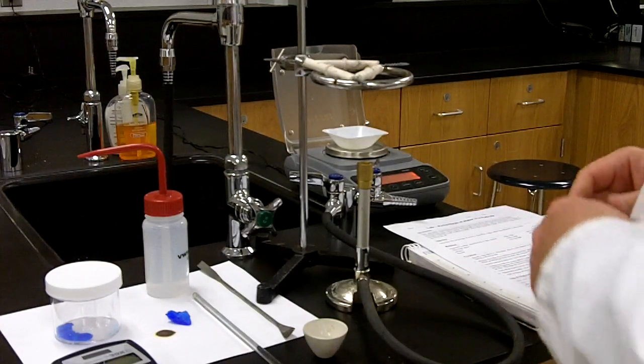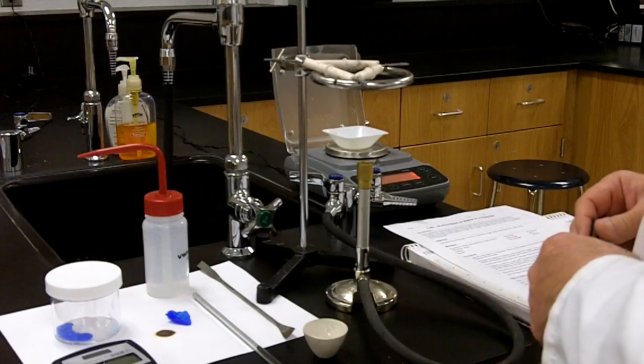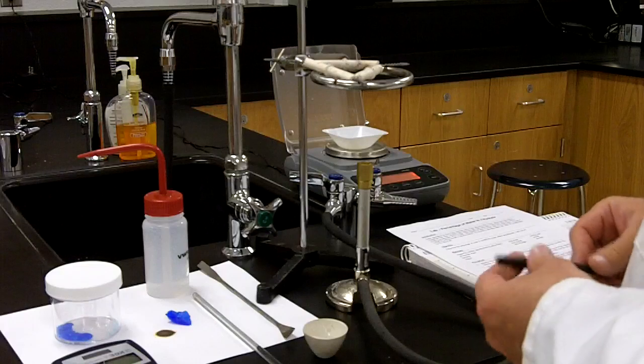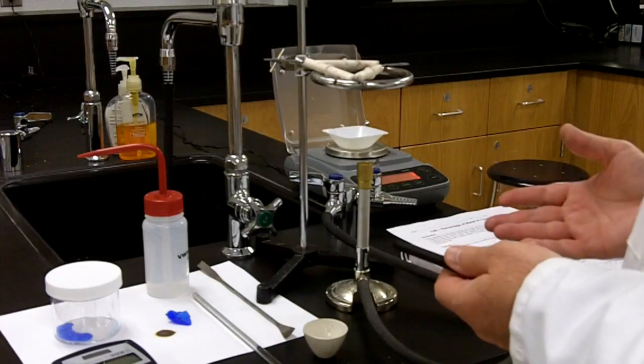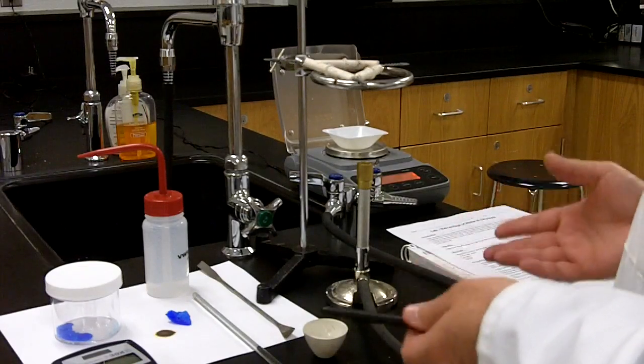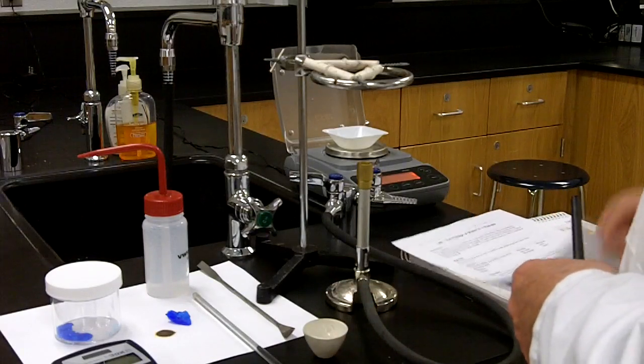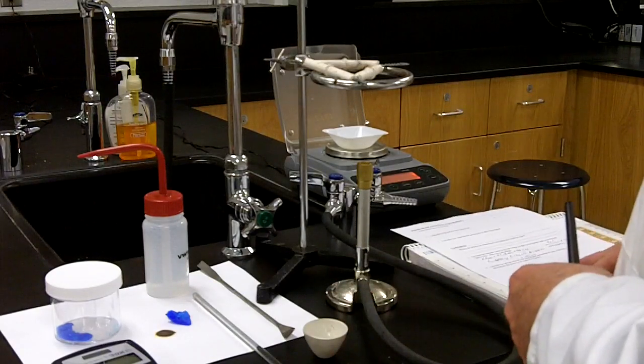And while we're doing that, we're going to do a couple of calculations. One of the calculations that we want to do is we want to make sure that we know how to do the calculation for determining the amount of water in the copper sulfate pentahydrate. So there are some questions on the back of the sheet that require that we do that.